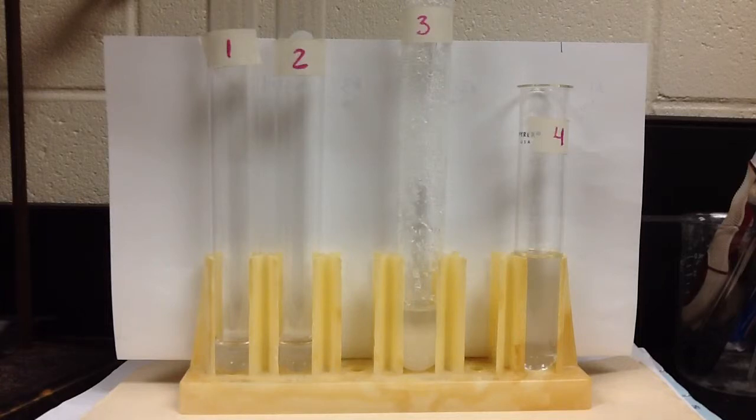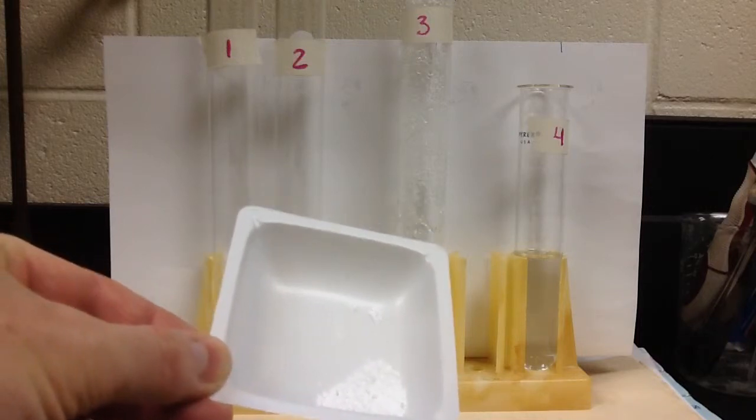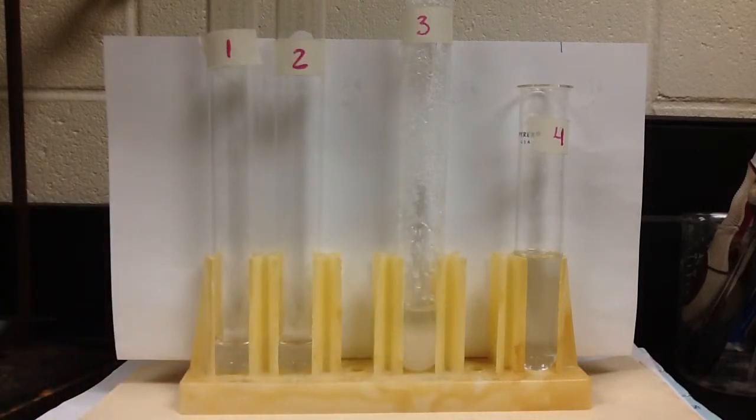So in test tube number one, we've got five milliliters of water, and what we did is we added 0.5 grams of sodium acetate to it. Sodium acetate is just a white chemical, the powder there, and we added 0.5 grams into test tube number one, and we shook it, and after shaking a little while, everything dissolved.